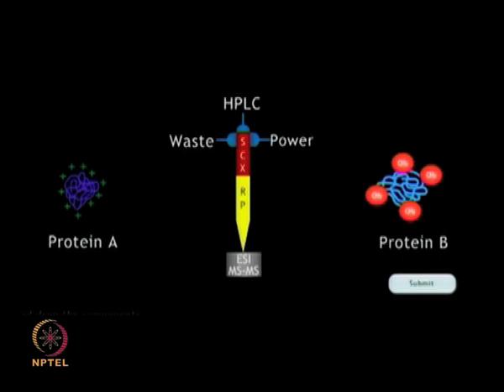Earlier we have talked about how one can make use of different properties of strong cation exchange and reverse phase chromatography to separate out peptides. Now, use those basic concepts and drag and drop the proteins that will interact with the SCX and RP regions of the columns respectively.